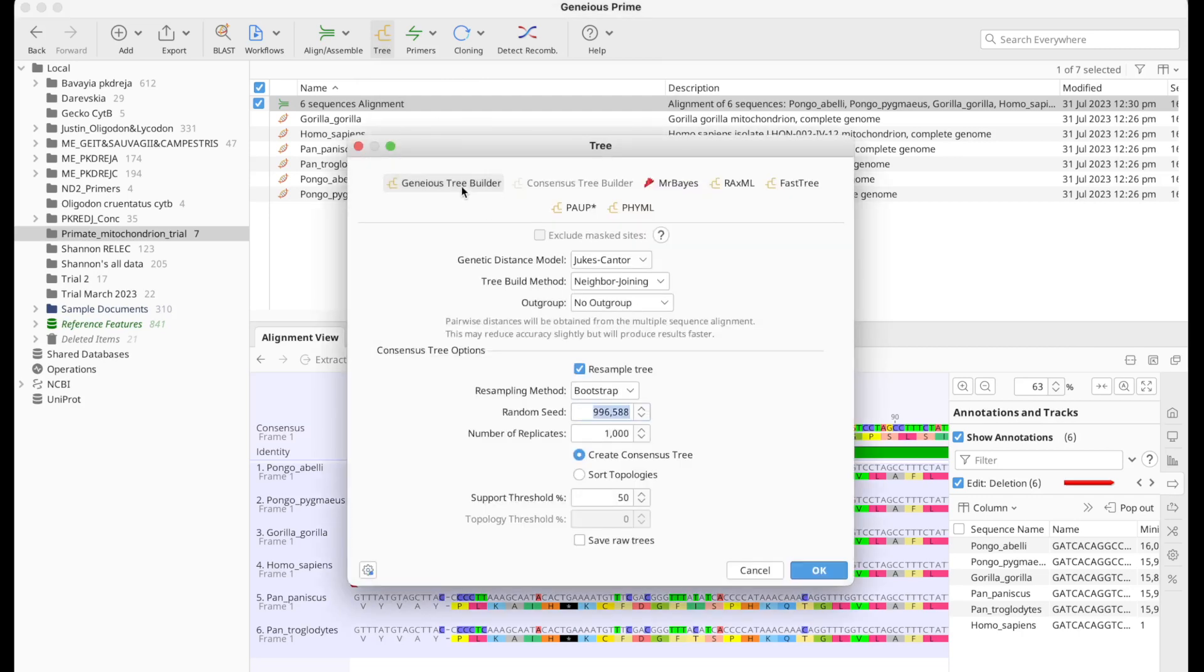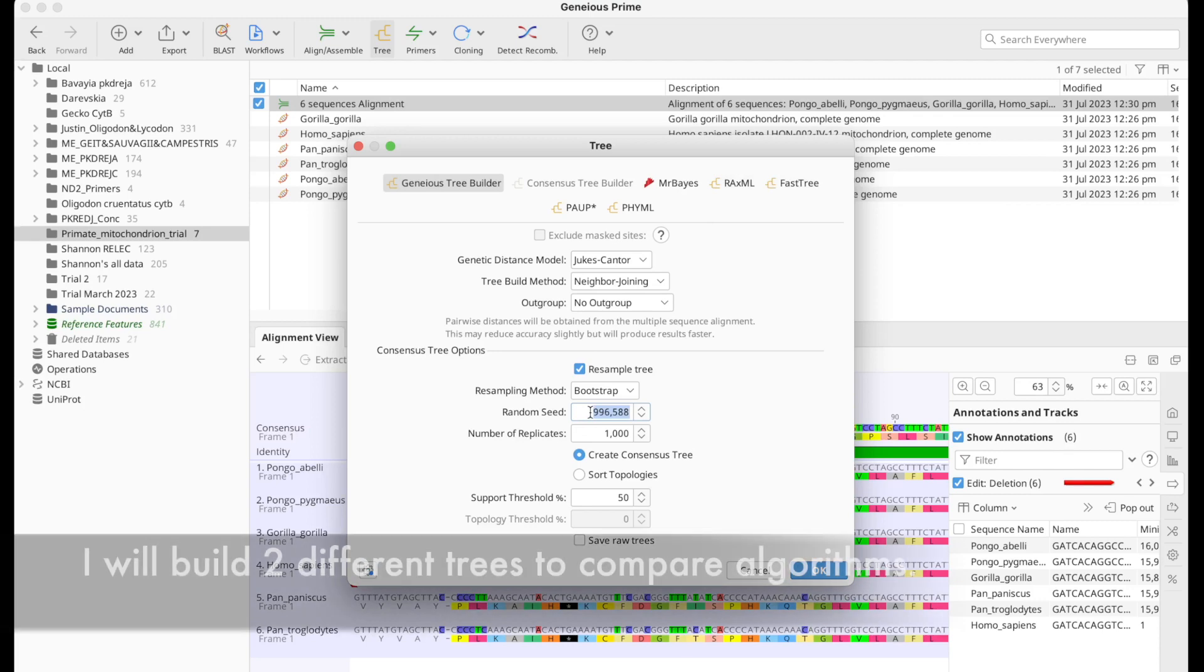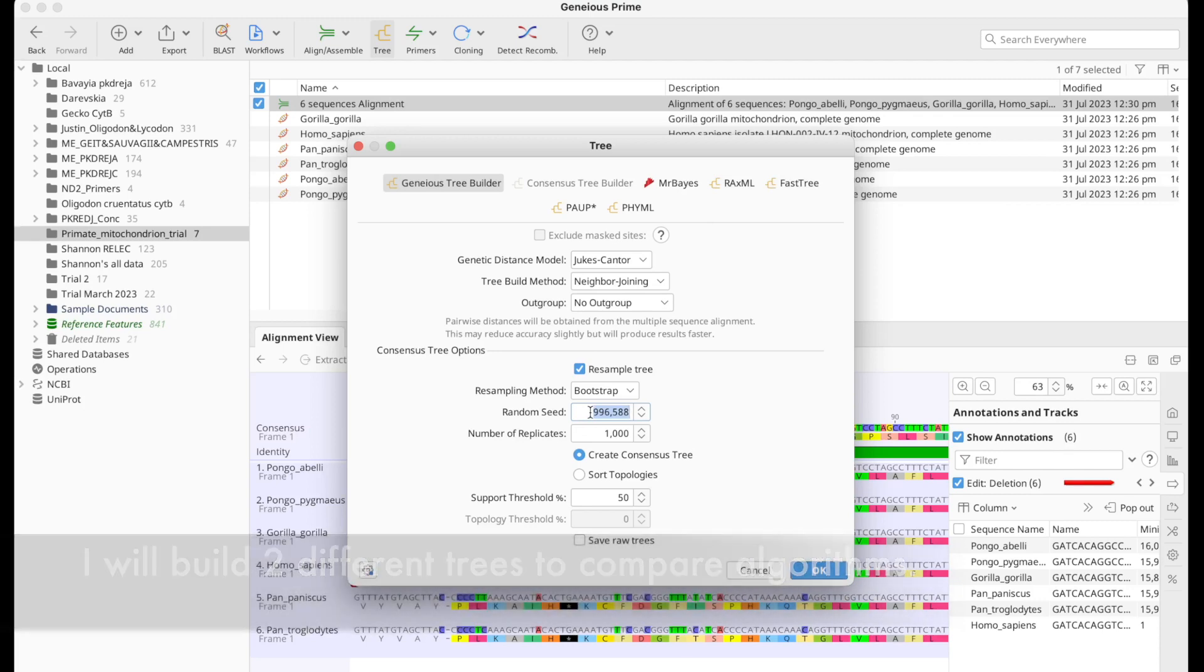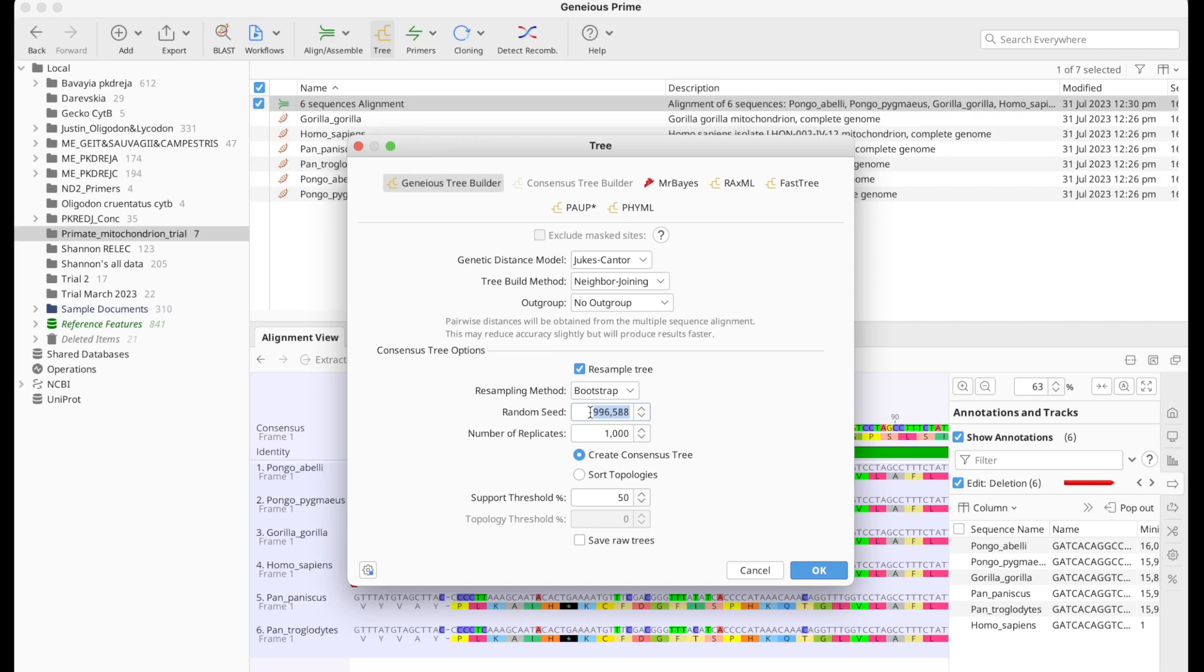A couple of options: Genius Tree Builder, RaxML, FastTree. Now I would like to go with two different trees. One with Genius Tree Builder and then the other one is going to be RaxML. RaxML because it doesn't take a lot of time, and then Genius Tree Builder because it lets me put in bootstrap values.